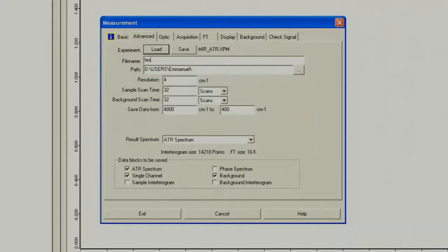In the advanced tab, you can change the folder path for your data, and you can change the scan time and background scan time. Typically, the number of background scans is going to be anywhere from 64 to 256, but it could be a lot more. The number of sample scans should always be less than or equal to the number of background scans.